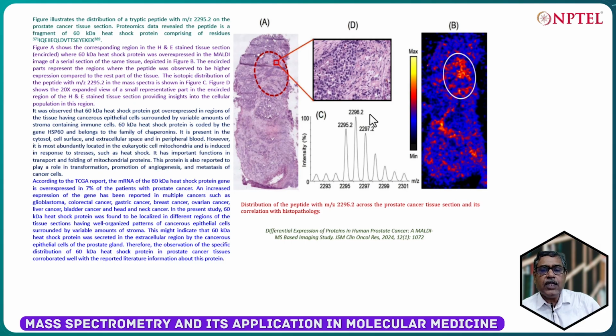That we have studied previously also. I am just mentioning that everywhere, no matter whether the peak comes from tissue or from solution phase analysis, from toxin, from any organism, the natural scenario is the same.